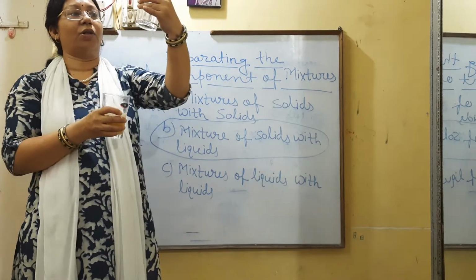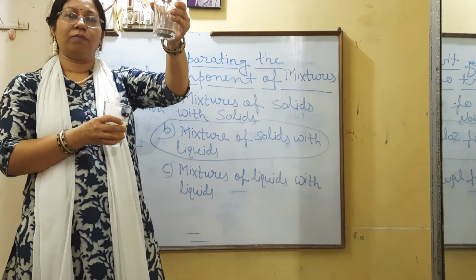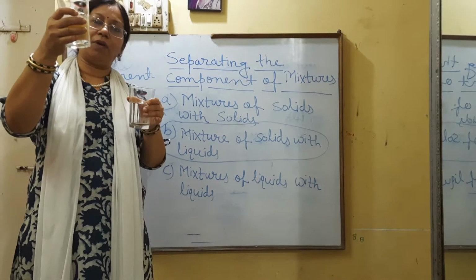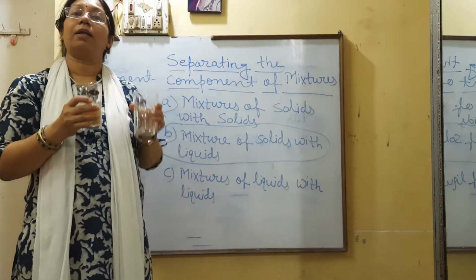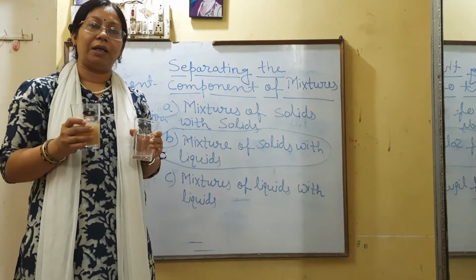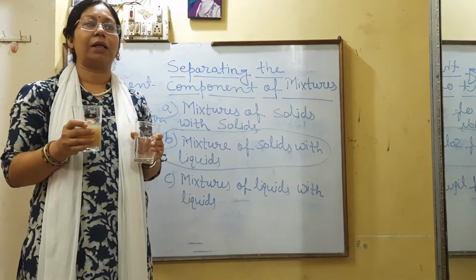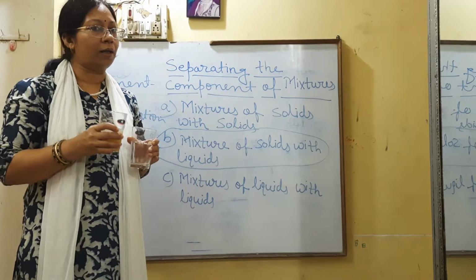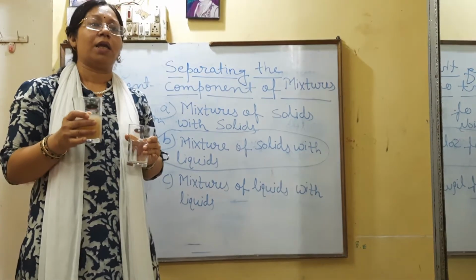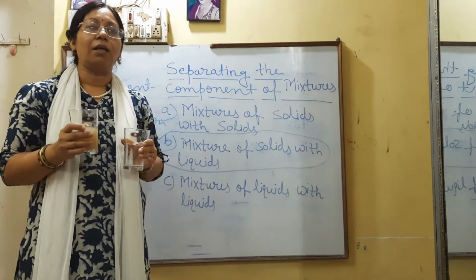Now you can see at the bottom more soil particles are there, and the clean water above I poured into another container. This process is known as decantation. Pouring the clean liquid into another container without disturbing the sediment is known as decantation.